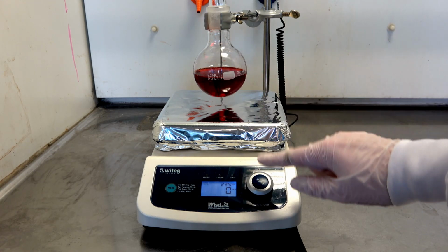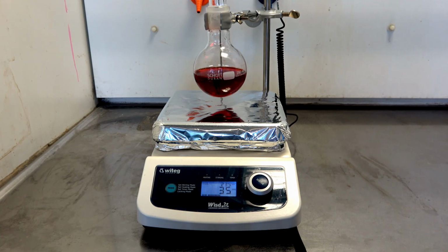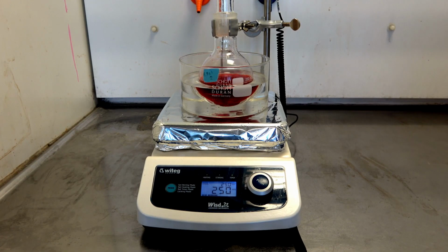If a reaction is carried out at room temperature, make sure that the heating is turned off. Otherwise, it could cause an accident. If heating is necessary, make sure to monitor the reaction and handle it with care. In heated reactions, use an oil bath for appropriate heat distribution.